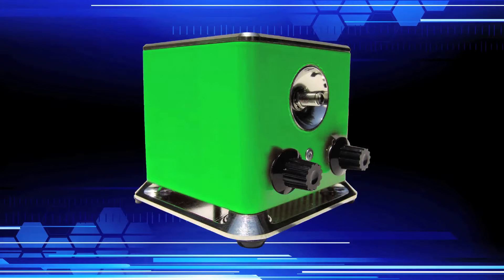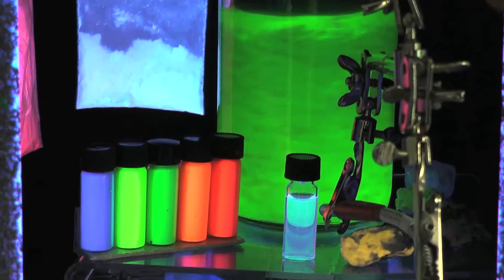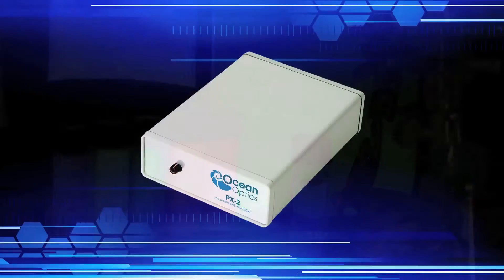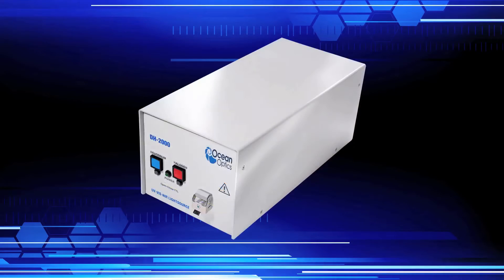This particular LED was chosen because the peak excitation wavelength of fluorescein is close to this value at 490 nanometers. This will vary depending on your fluorescent sample, so make sure to look into which light source will be most useful for your application.